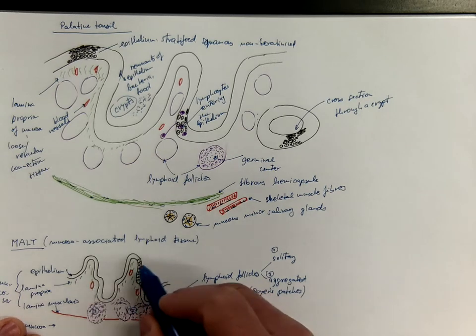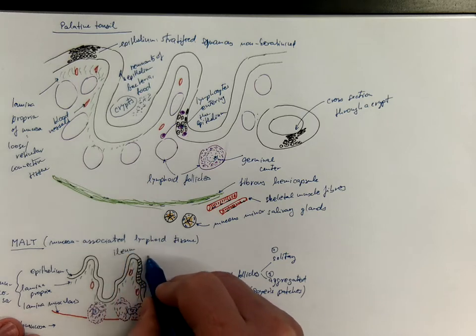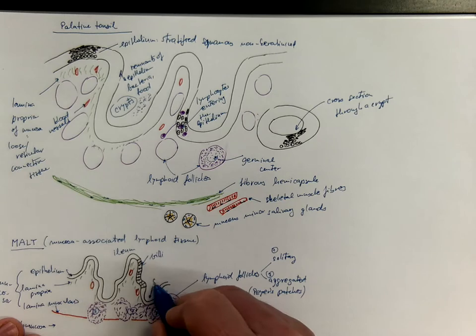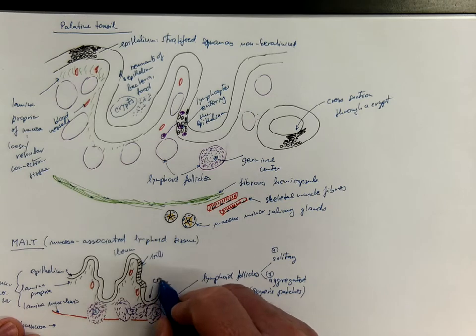And this would be an example from the ileum. Okay, here you have the villi, the mucosa, the intestinal crypts.